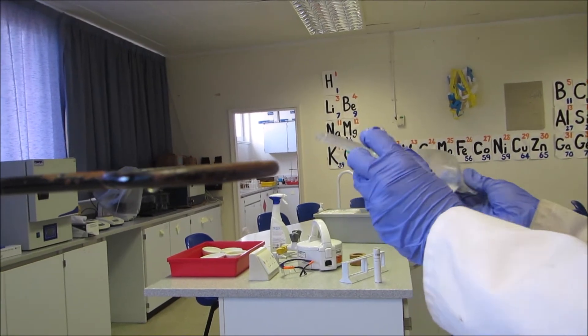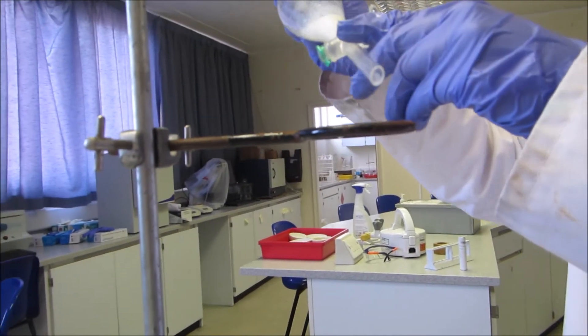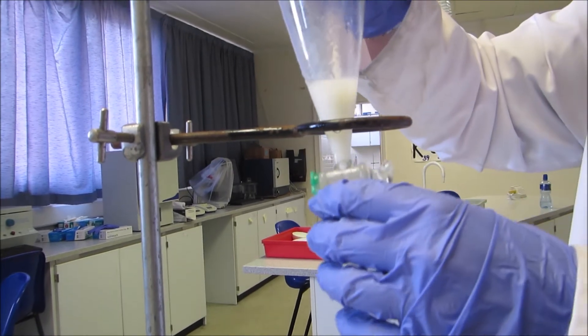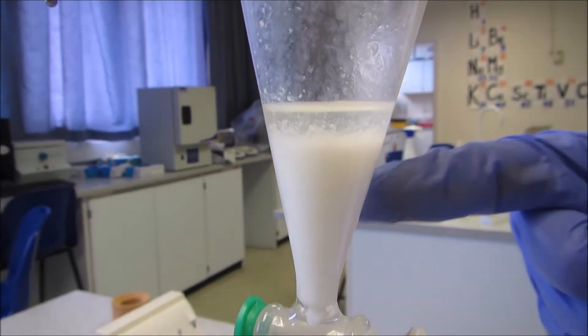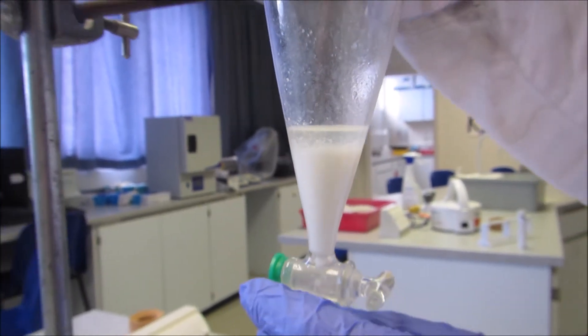So that should be enough. I'm now going to let it settle, and we should see two layers form. So it's now separated into two layers. We have our milk layer and our isopropanol with the fat.